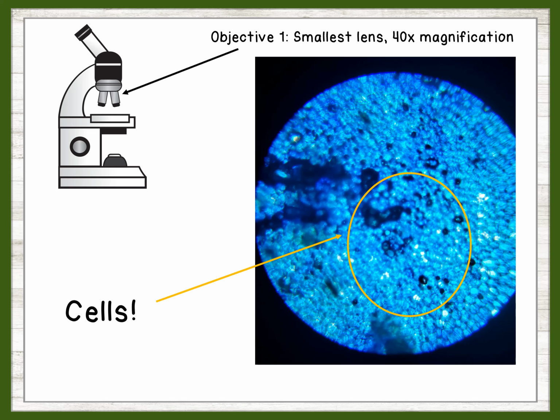If you've already viewed the animal cell, you probably notice right away that there are many differences between the 2 cells. The defining difference between the 2 cells is that plant cells have the ability to produce their own food sugars through photosynthesis. But can you spot some of the physical differences between the cells?